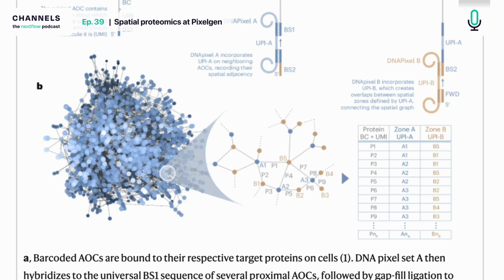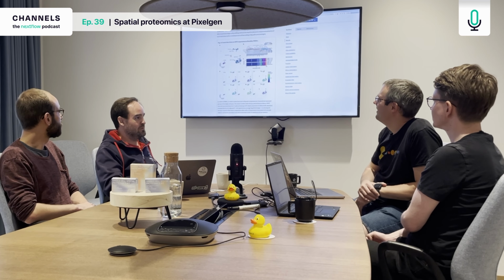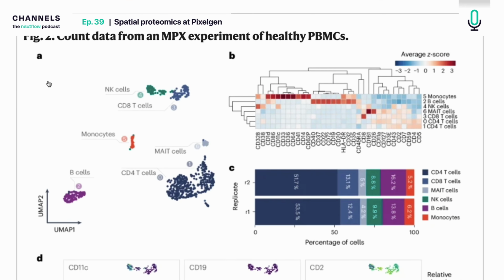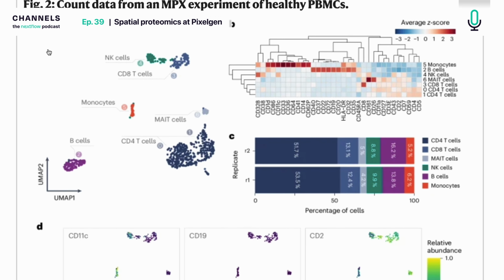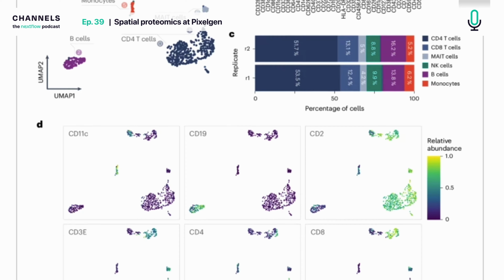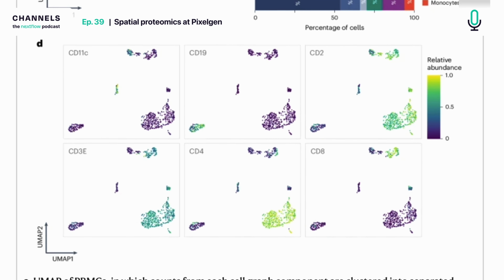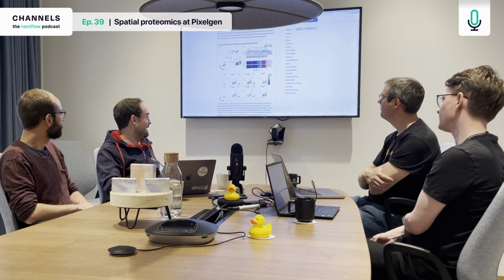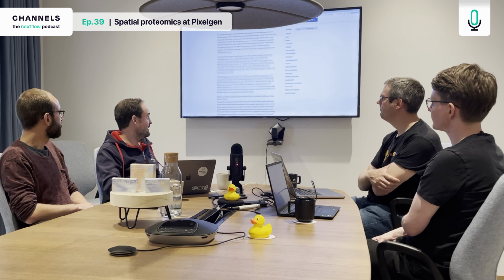And then basically the second picture is making sure that things work. So we take a couple of donors from the Karolinska Hospital actually. And then we make things that look interesting at the single cell level. You can classify cells into different groups and cell types, and it makes sense. The proportions are repeatable. There are replicates there, the donors as well. You can integrate them, and things make sense. Yeah. So that was kind of like a control check to say that things work.